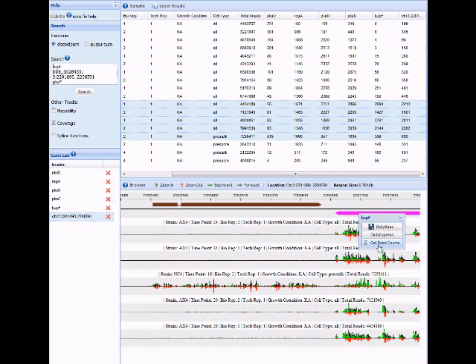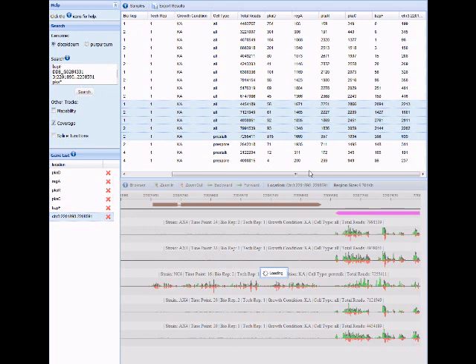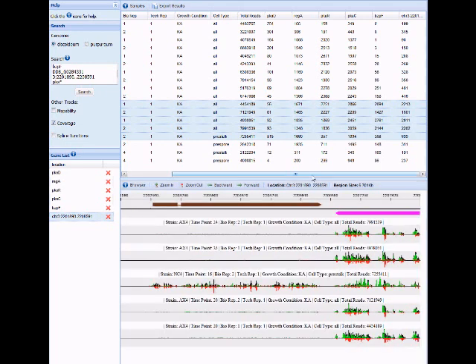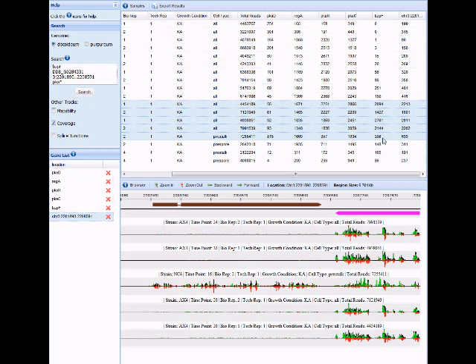If you want to get the read counts for this particular gene, you can click the Get Read Counts button. This will populate the sample panel again with the BZIPF read counts across all of the samples.